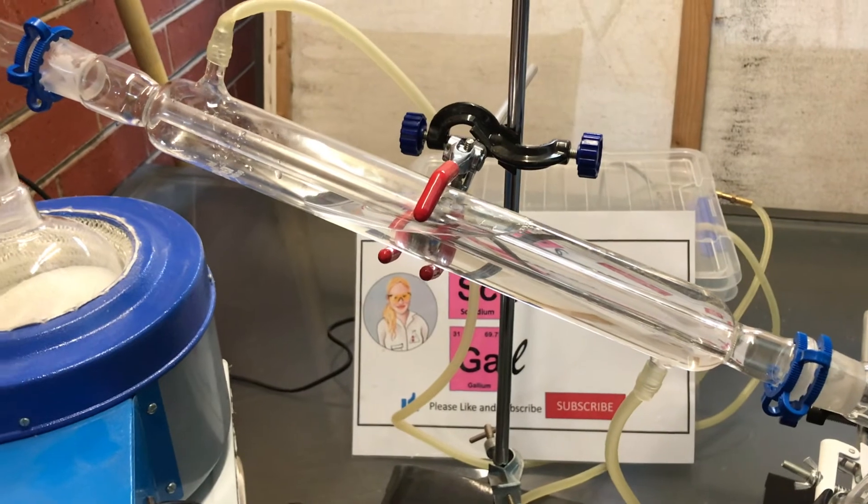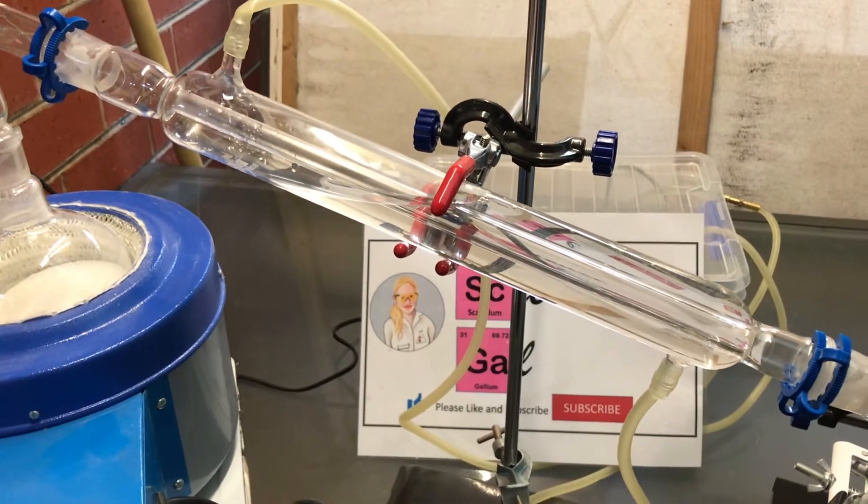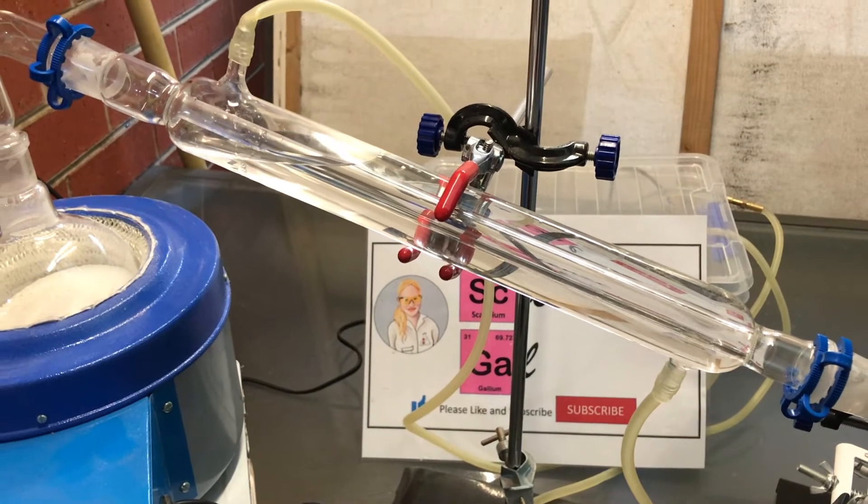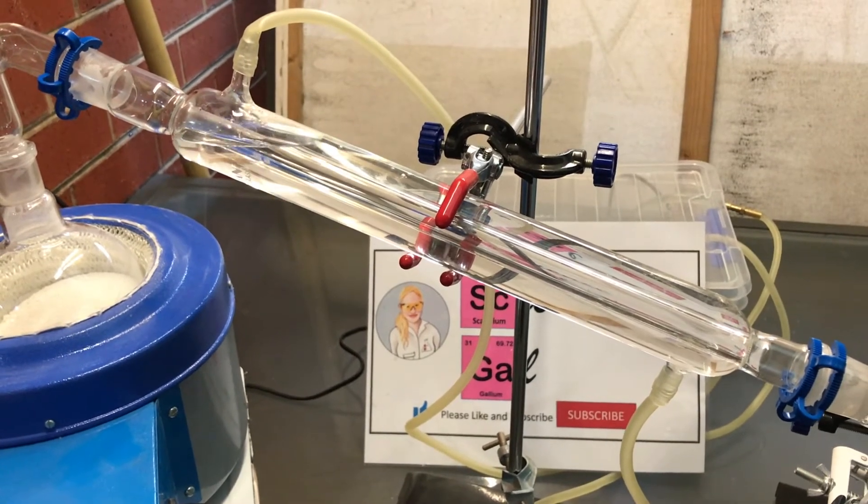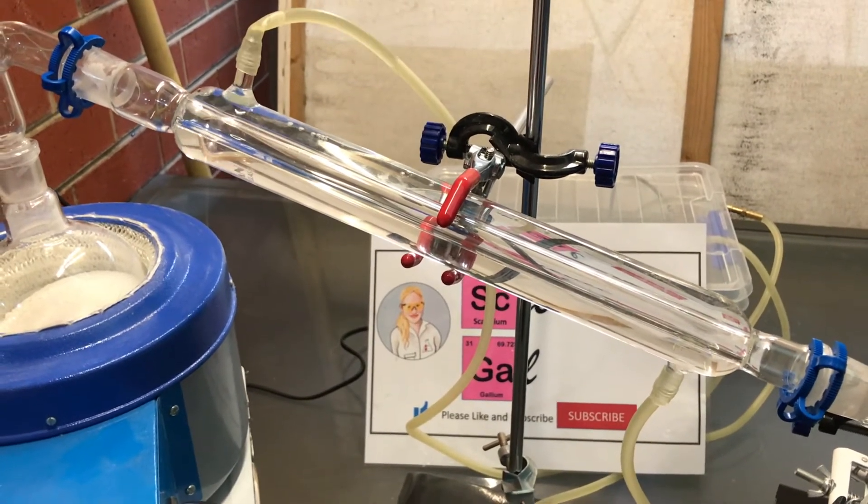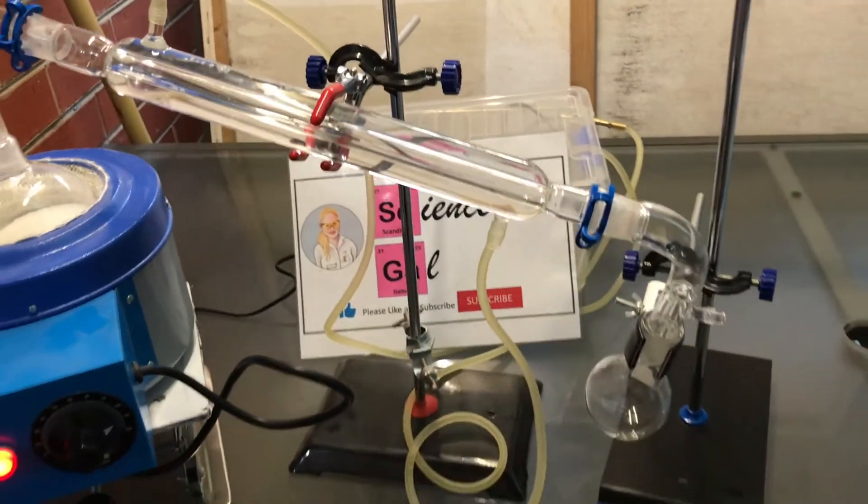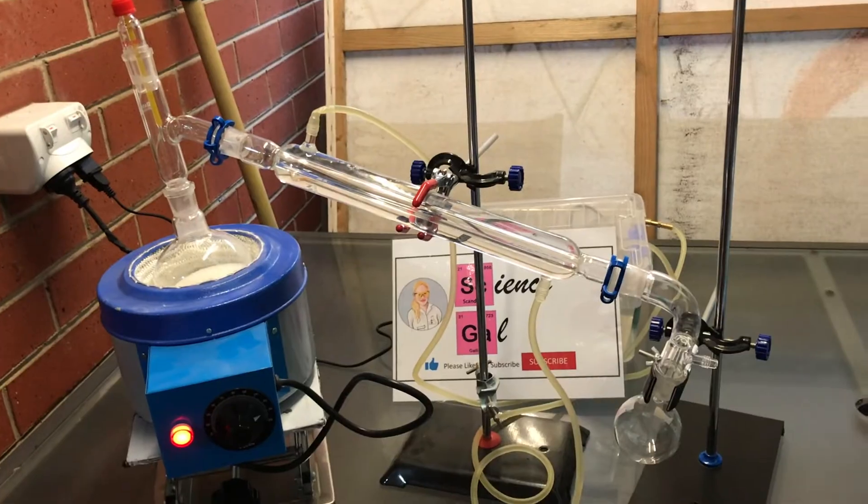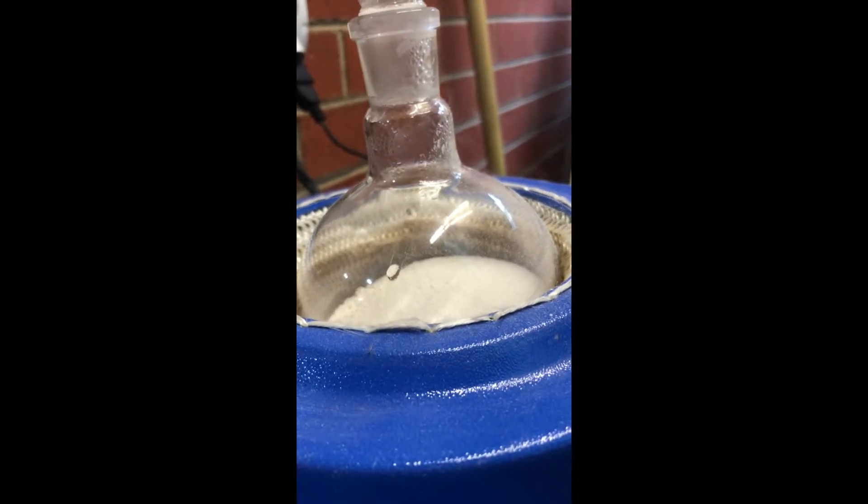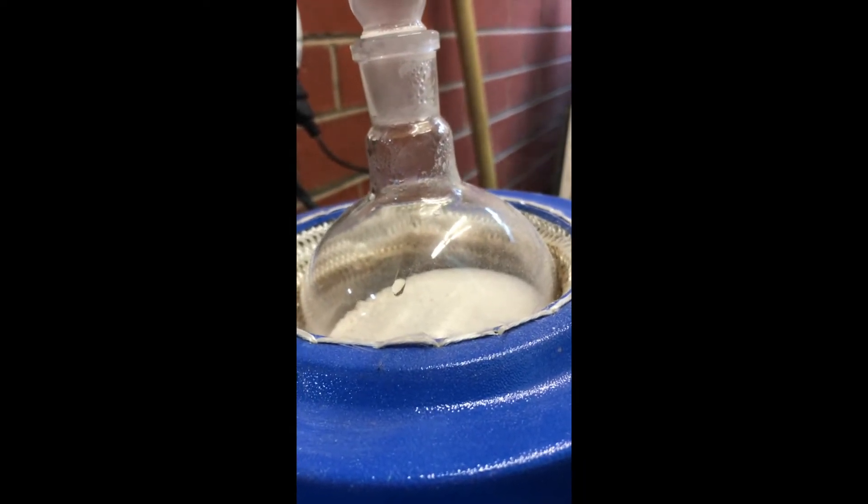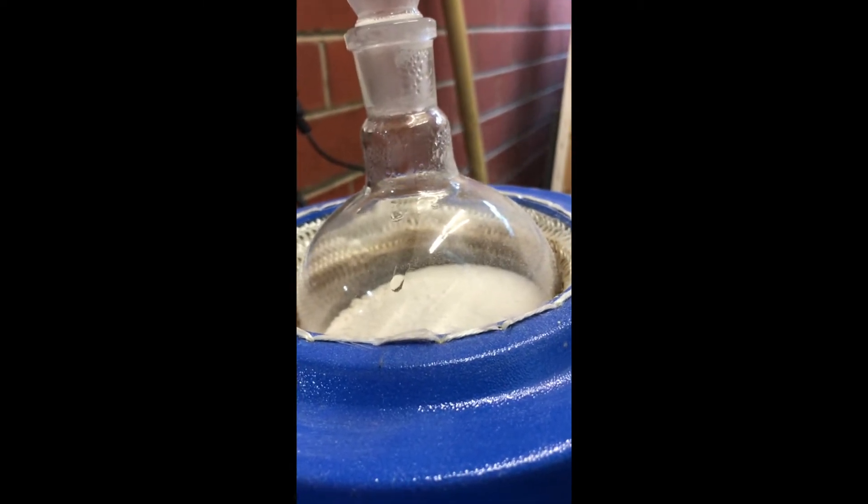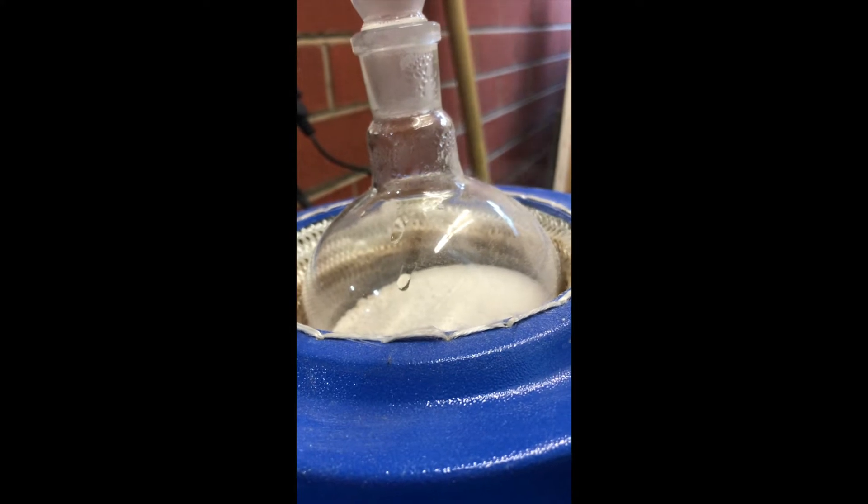As you can see, the water goes from the bottom of the condenser to the top. After turning the heating mantle on, shortly afterwards there started to be condensation on the flask. This indicates that the calcium acetate is more hydrous than I would want it to be, and I probably could have left it in the oven a little longer.